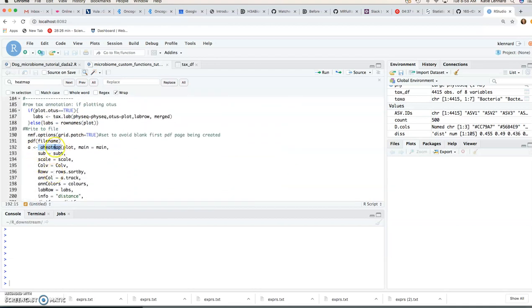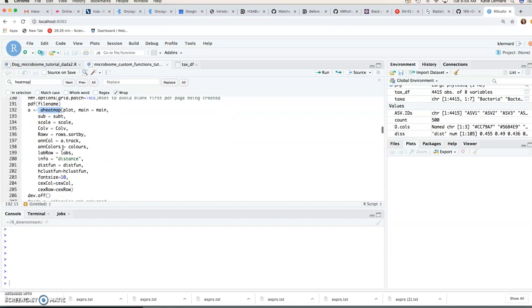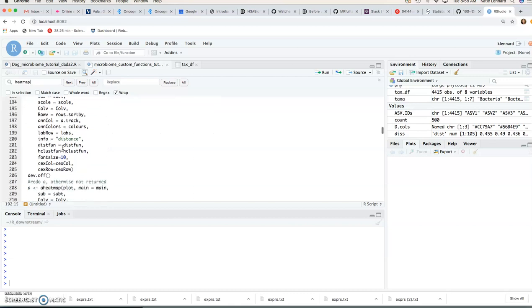We're going to get the annotation that we're interested in, add the colors that we want and then when you move to the bottom here you can actually see the aheatmap function from the NMF package and that this function is built around.